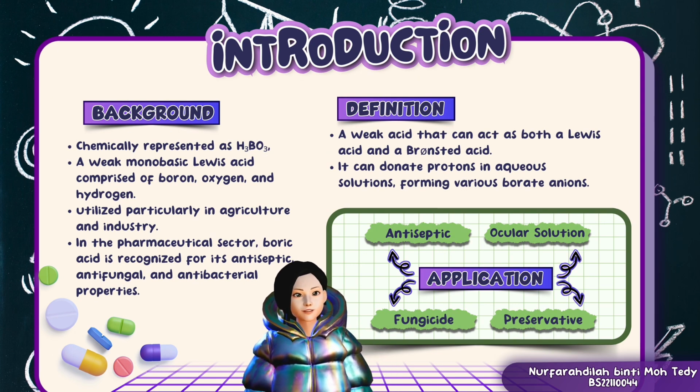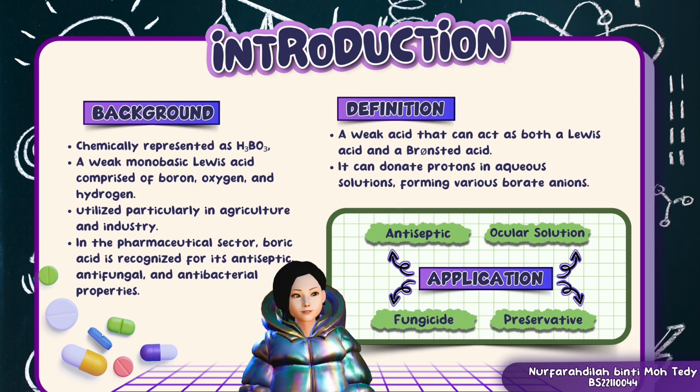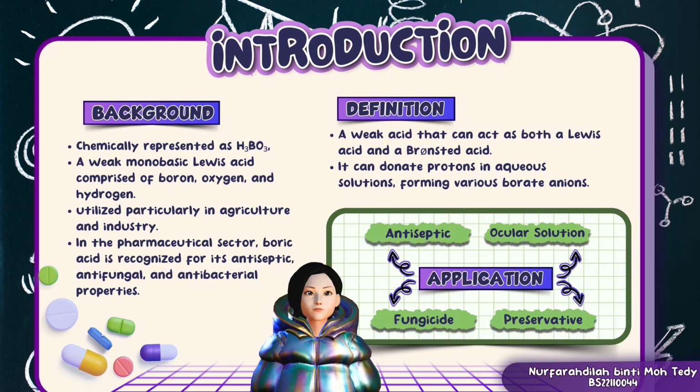Its effectiveness in treating infections and its role as a preservative in formulations make it a valuable compound in medical applications. This study highlights the detection of boric acid in various pharmaceutical formulations in the pharmaceutical industry.